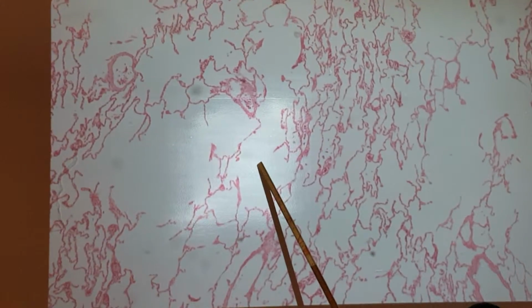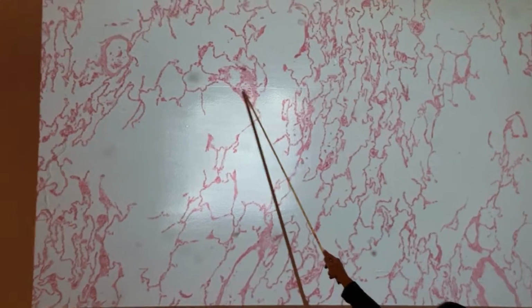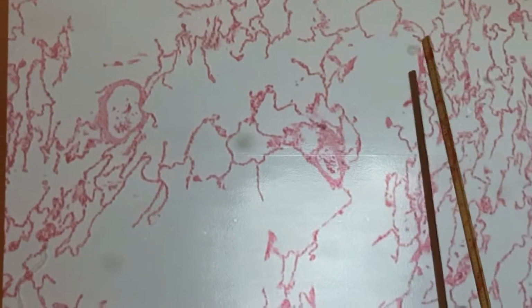All right, so if it's just pointing to the blank space, that's the alveolus. It'll say, what is the space at the end of the pointer? Alveolus is what you're looking for. These would be capillaries. You can even see a little blood inside of them. So that one over there. If it's nice and closed areas, like that one way at the top, capillaries. Pretty easy.